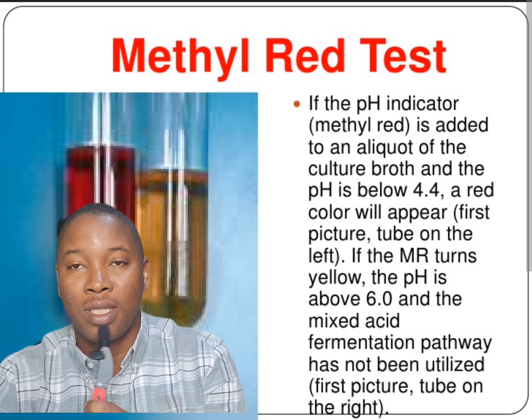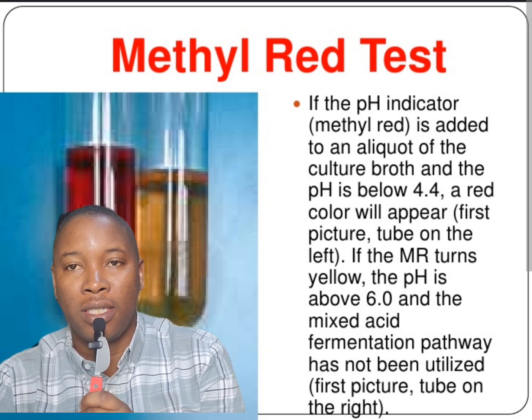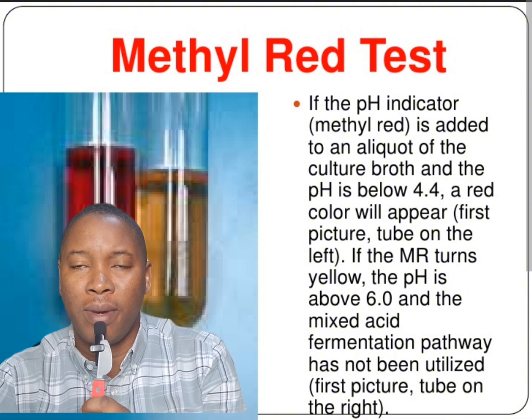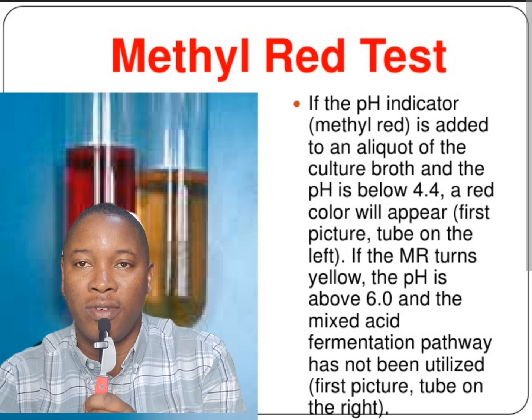This morning we'll be discussing the methyl red test. Now remember, we are talking about the battery of biochemical tests that are used to identify microorganisms in the laboratory, and the essence of all these different tests.